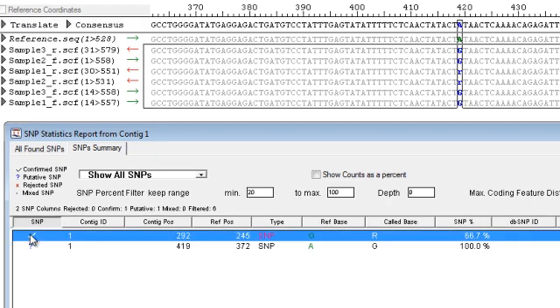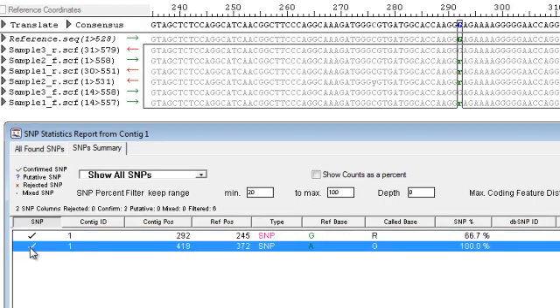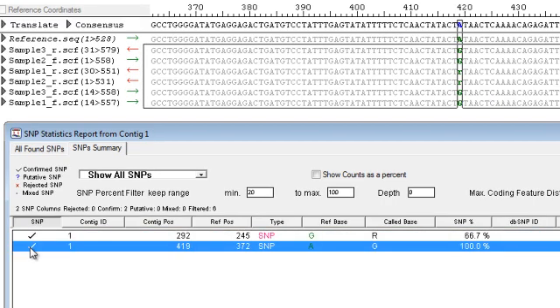You can then confirm these SNPs to create a variation feature on the consensus, which will be visible when exported to other applications.